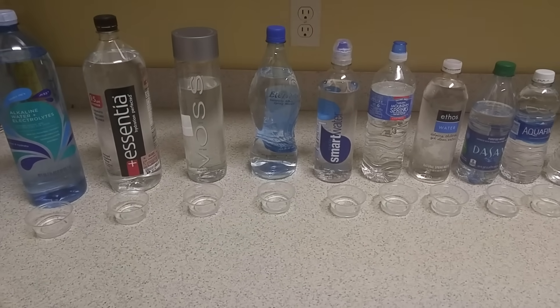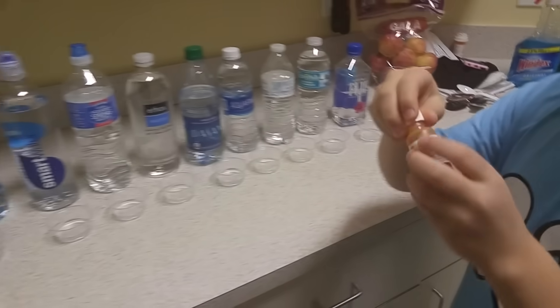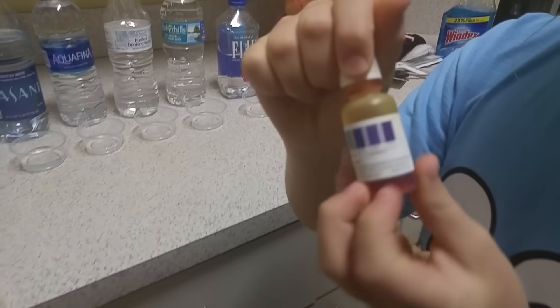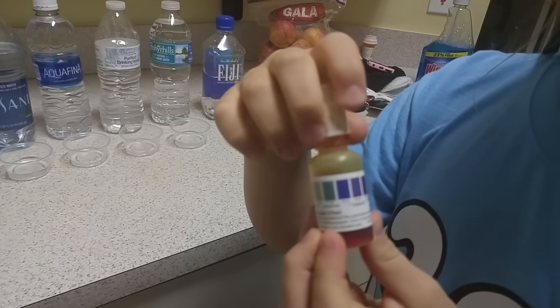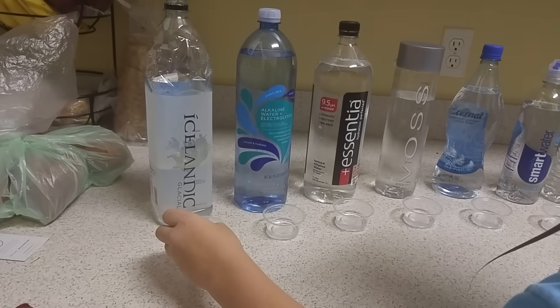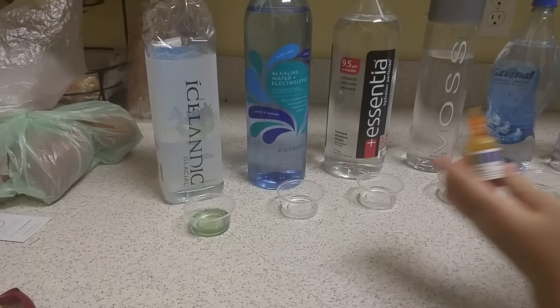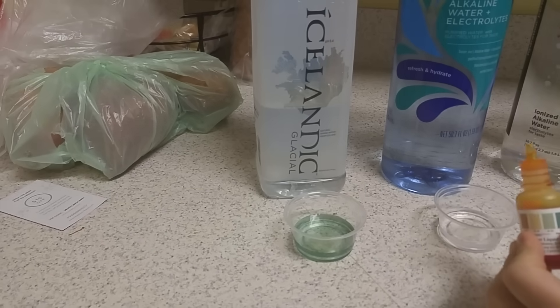We're going to have the assistant get the drops going. The bottle shows the different colors that we're going to match up at the end. Let's start with Icelandic Glacial, which advertises a pH of 8.4, and Trader Joe's alkaline water with electrolytes, pH of 9.5.